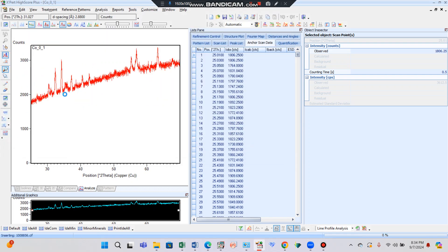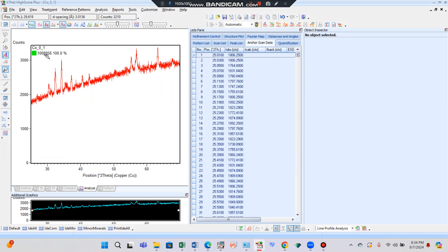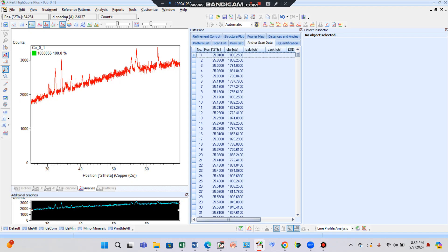Open this file. You can see here that file number 1008558 is 100% matched with your peaks, so the first step confirms 100% matching.